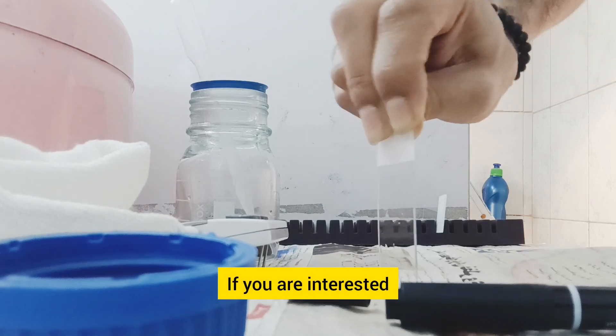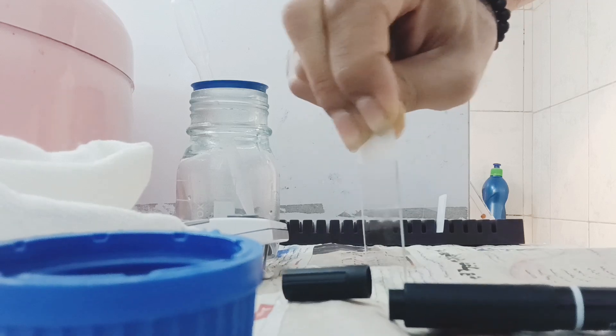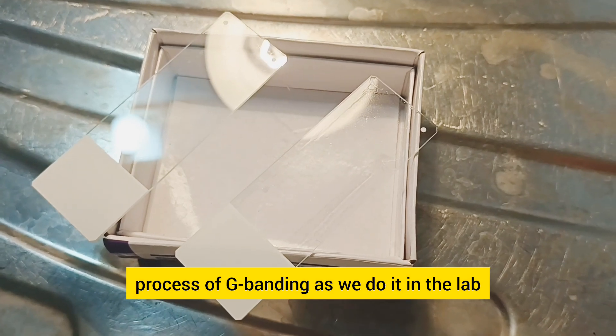If you are interested, I can create a comprehensive video on slate preparation — please leave me a comment. Now let me walk you through the step-by-step process of G-banding as we do it in the lab.